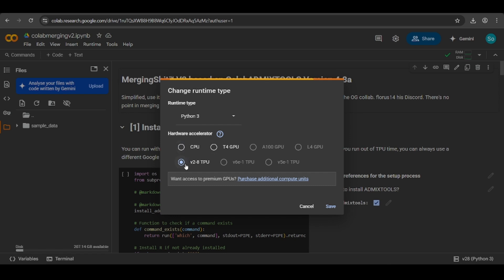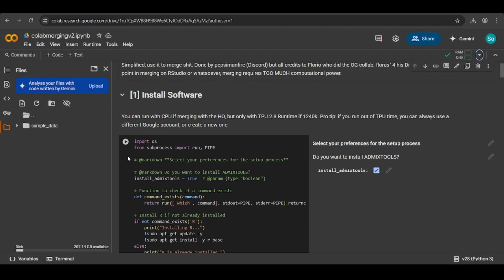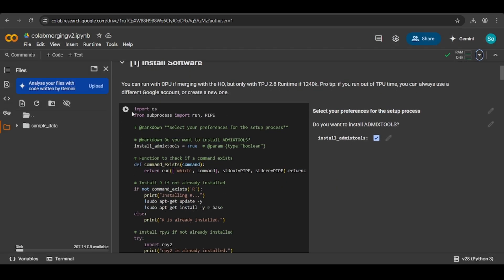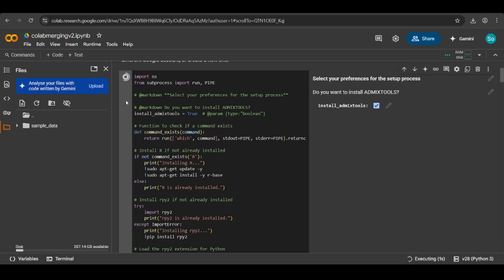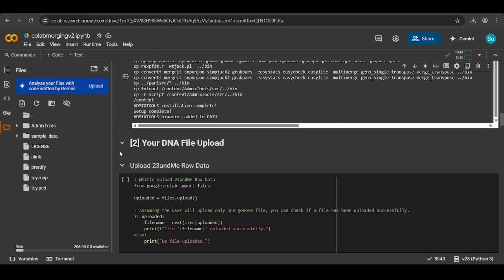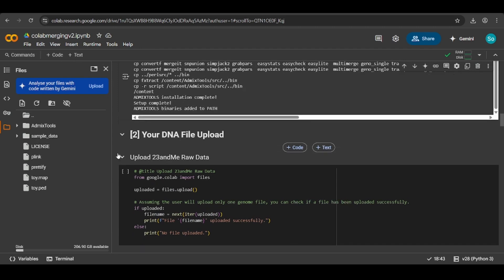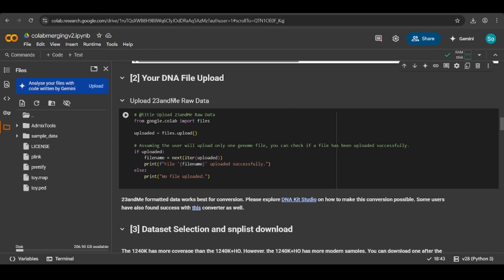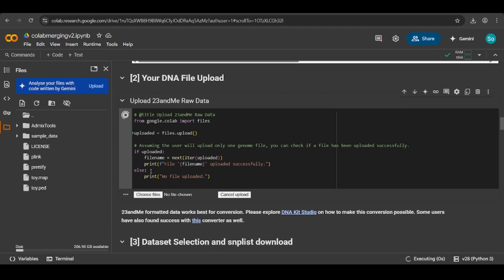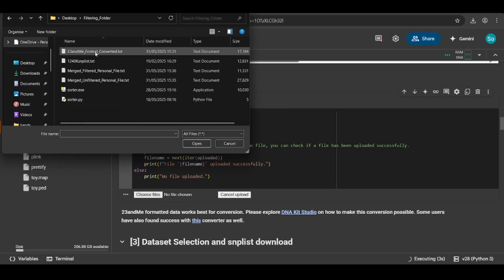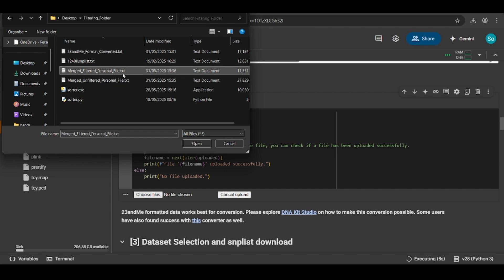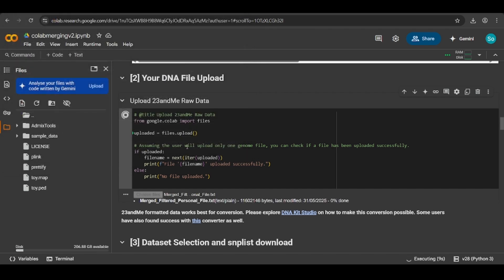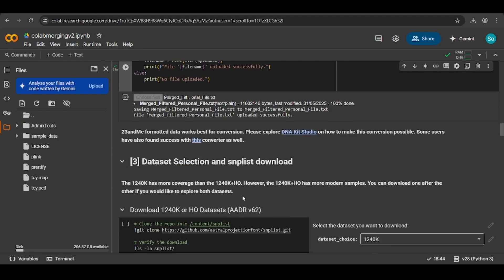You need to select TPU, hit save, and then you want to first install admixtools. Hit play. Okay, so now that's done, admixtools has been installed. Next, you want to upload your 23andMe raw data. Hit play, hit choose files, and from the filtering folder in the last tutorial, we have the merge filtered personal file. Click on it, click open, and then let it upload.